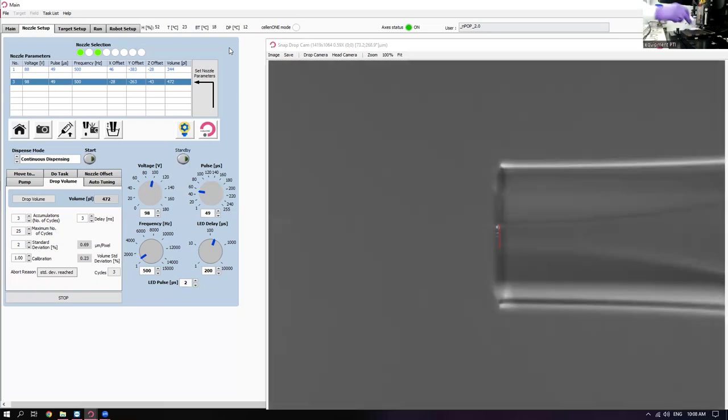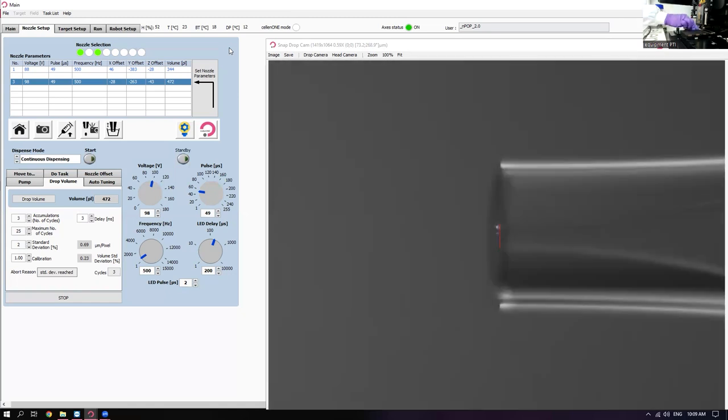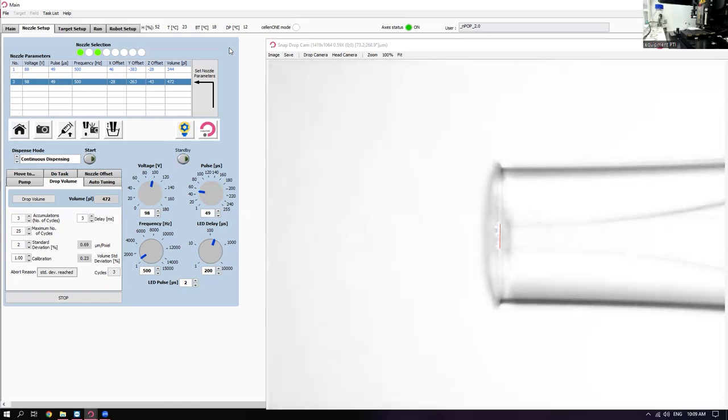We have a couple of different reagent reservoirs. This is kind of specific to nPOP for the pickup part of the protocol. We'll show you later. And then we have a place for tubes, which we use for our reagent and cell dispensing. If you have really rare cells, you can certainly come out of a 384 well plate with a low dead volume, to try to get all or most of the cells.